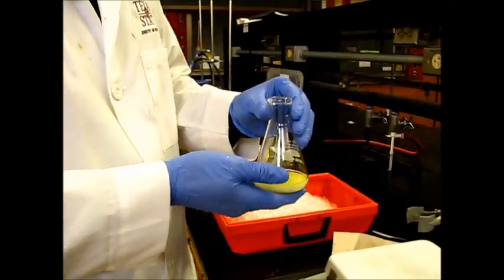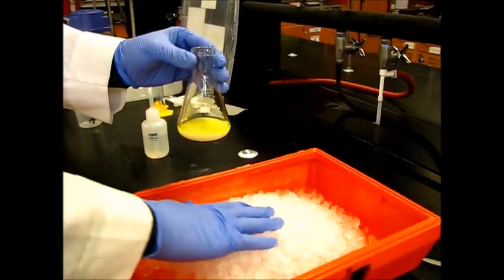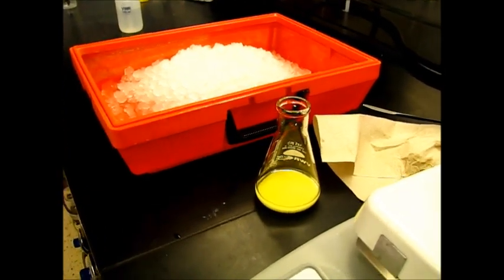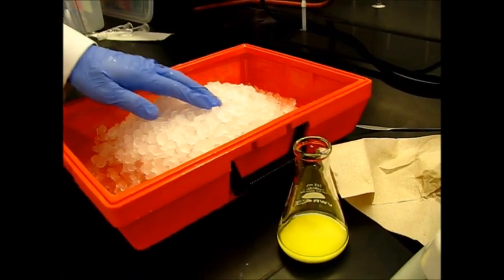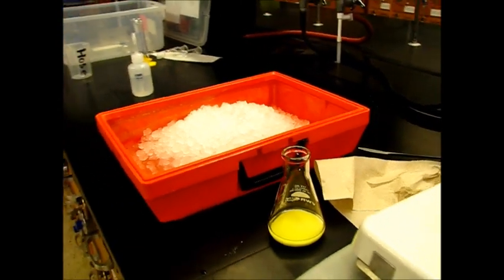Now for the recrystallization, we're just going to let this cool slowly to room temperature, and then we're going to cool it to about zero degrees in the ice. You don't want to cool it too quickly, because then you can trap some of your ortho product in your solid.